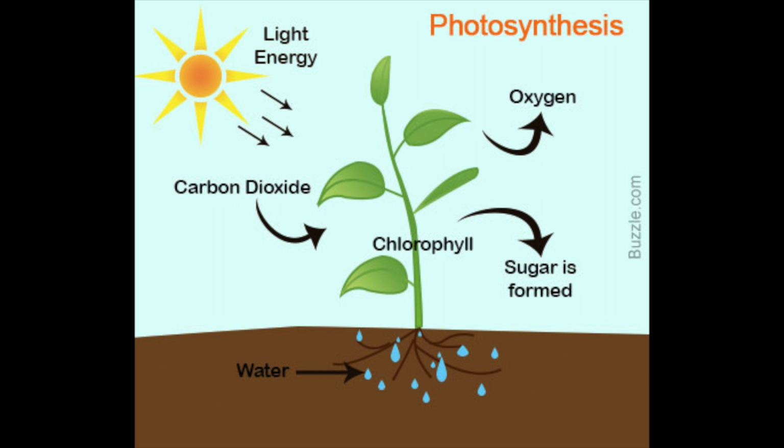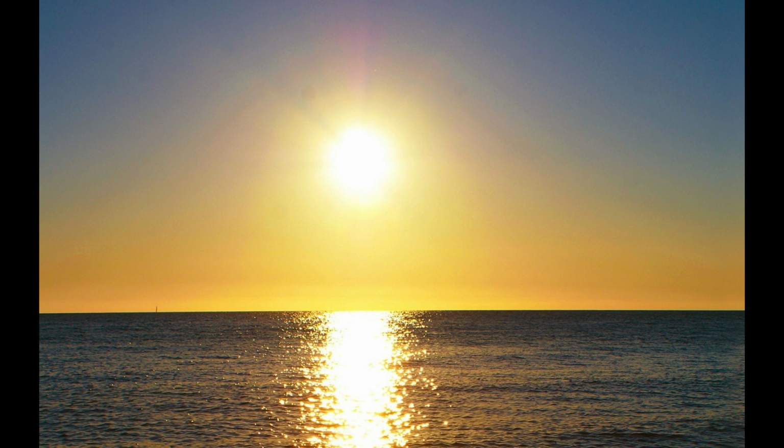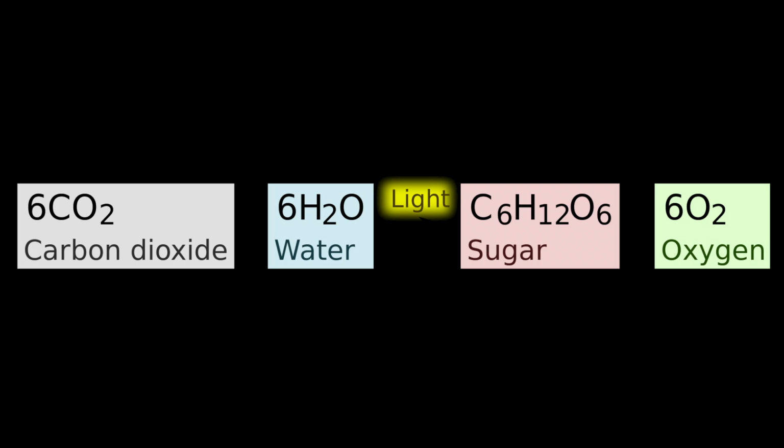Photosynthesis is the process by which light energy is converted into chemical energy. This fuels ecosystems and replenishes the Earth's atmosphere with oxygen. The rate of photosynthesis, which is what we will be testing today, can be measured by either the disappearance of substance or the accumulation of product. This is the equation for photosynthesis.